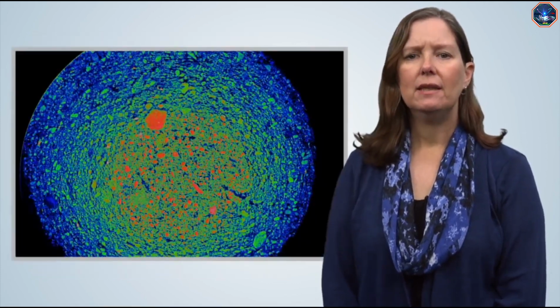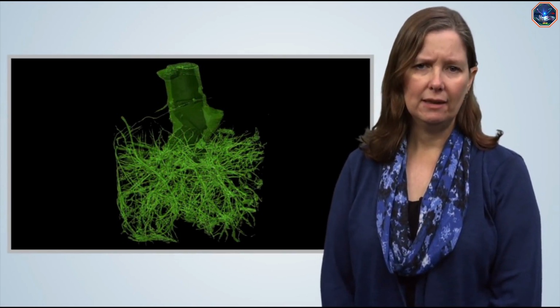The micro-CT can be used to illuminate delicate structures like the intrusions of roots in soil. The less dense materials, like the roots cutting through the core, are colored in blue, while the more dense pebbles and dirt are in oranges and reds. The roots can also be isolated and studied as if they were suspended in air.